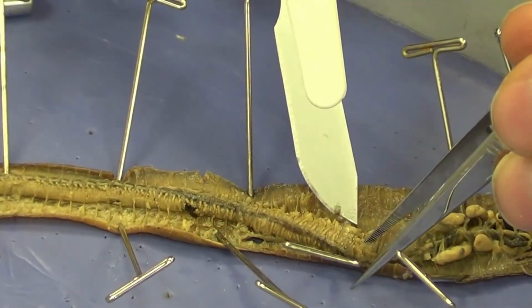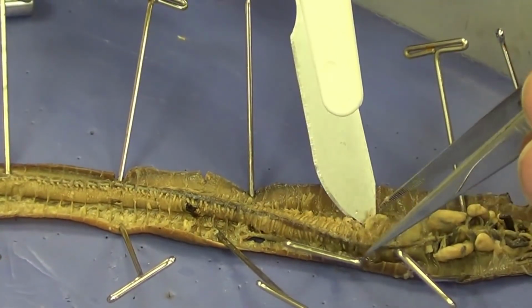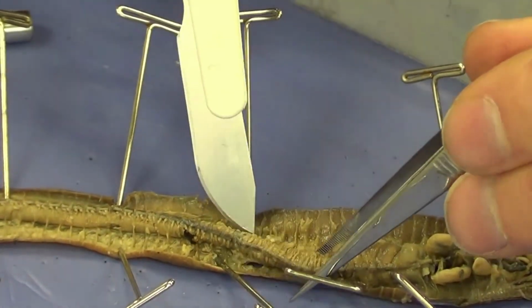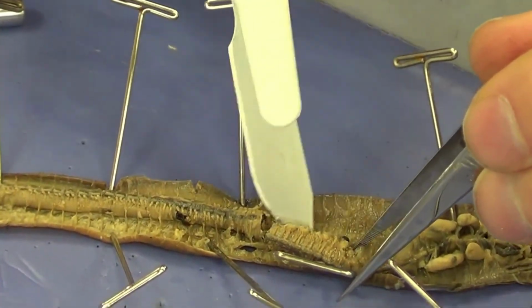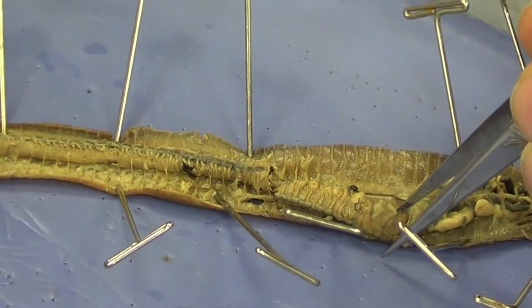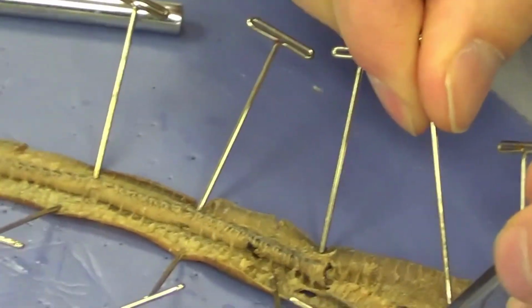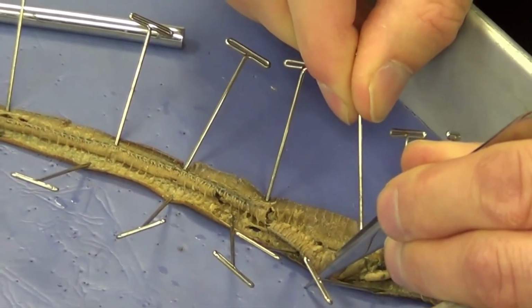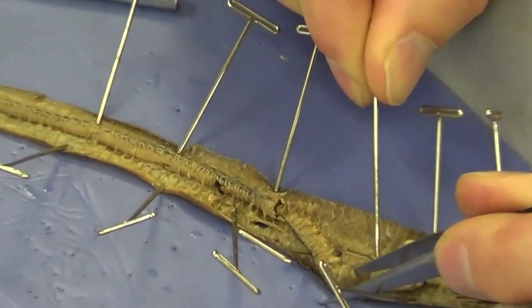I'm looking for a white fiber. It looks like a white thread. And I just very gently keep pushing it over, cutting the septa that are holding it in place. And where is it? It's coming into view right now. So I'm going to move this over just a little bit. I'm going to hold this out of the way so you can see this. And if we look in there, you can see this white structure right there. This looks like a white piece of thread. And that white piece of thread is going to be our nerve cord. You can see it right there.